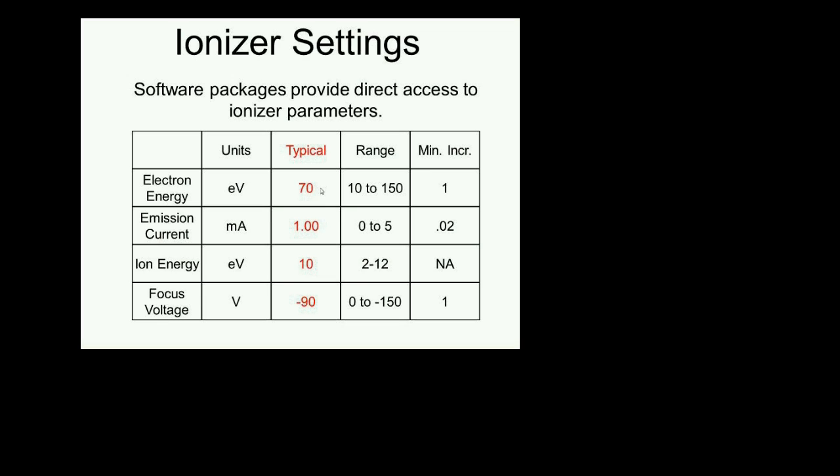So if you want to buy an RGA and use it so that you only see the organic compounds and you're not contaminated by all the peaks from air, you can set it that way. The recommendation is to call your vendor. They all know how to do it, and they'll give you a recommendation. It will require lowering the electron energy quite a bit, and there might be tricks they require you to do in terms of the emission current as well. But most of the time, I will leave the electron energy alone.